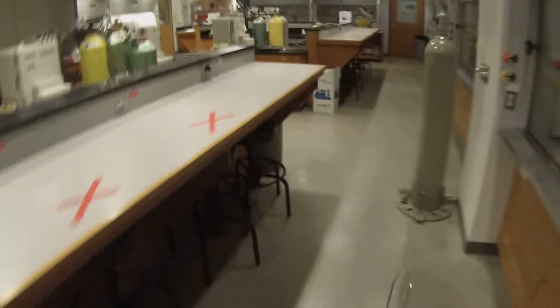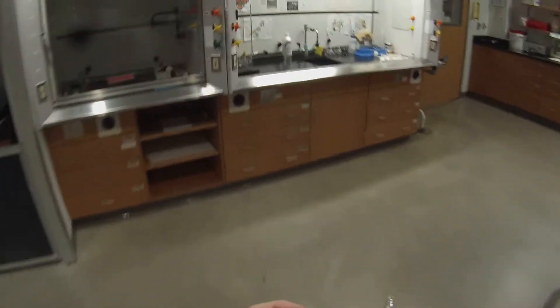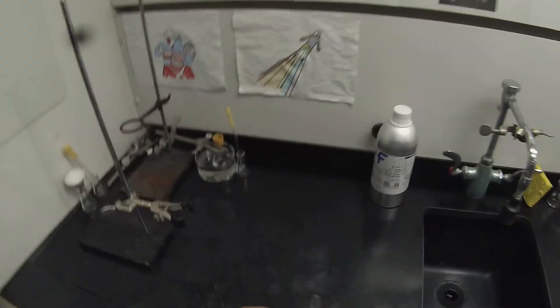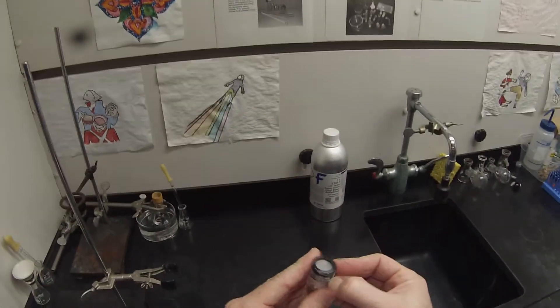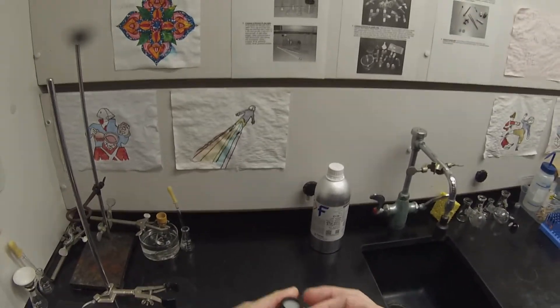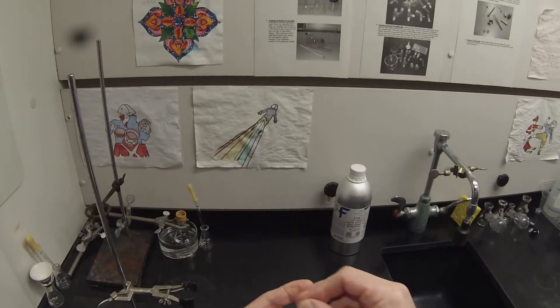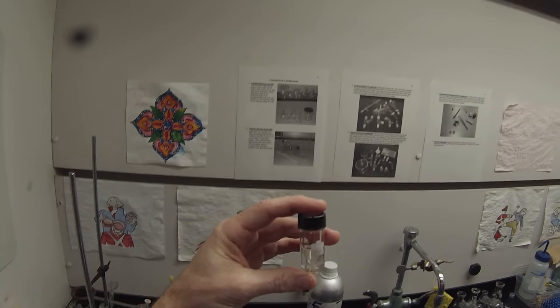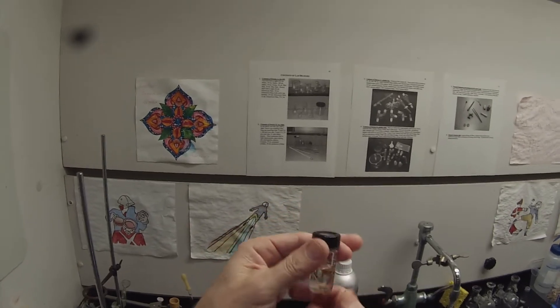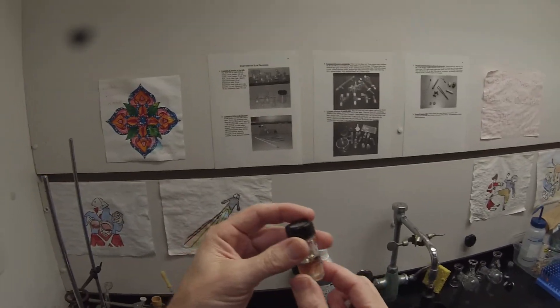So we'll take these back with us and let this warm up. We're going to be setting up a distillation to purify the ester, get it away from any of the residual acetic acid and alcohol that might be in there, mostly alcohol because we quenched the acetic acid.